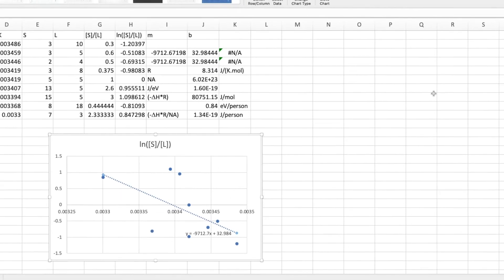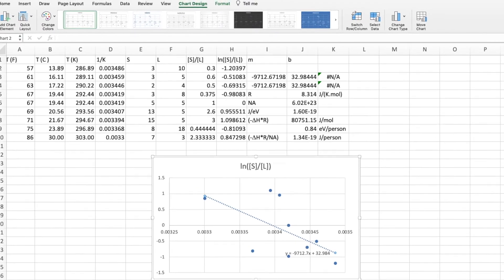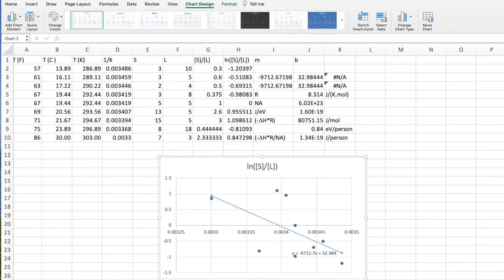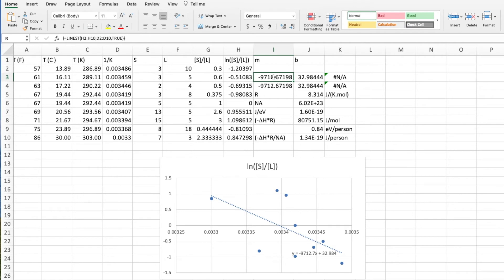You can do this directly on the graph, but using the statistics functions usually gets more accurate results. Here cell i3 shows the slope and cell j3 shows the intercept.